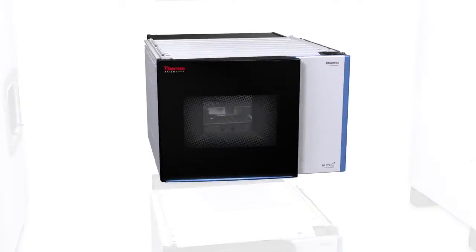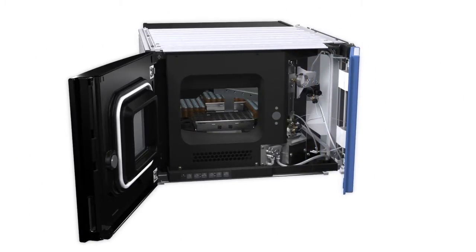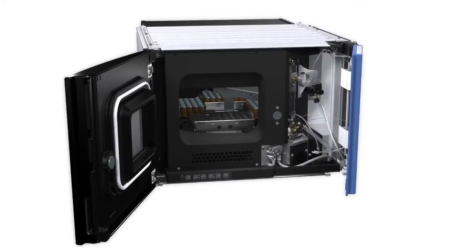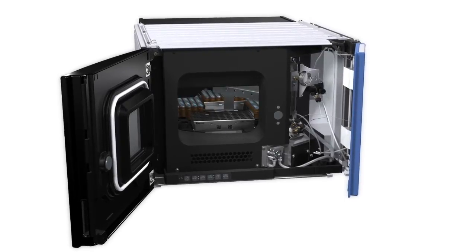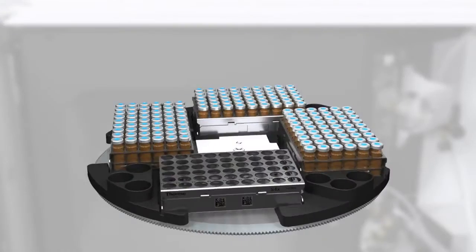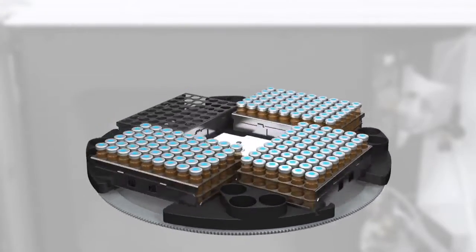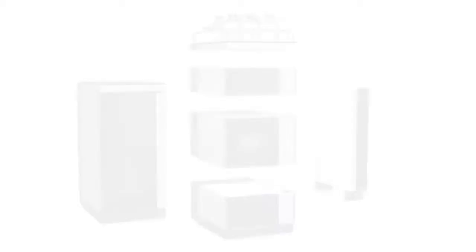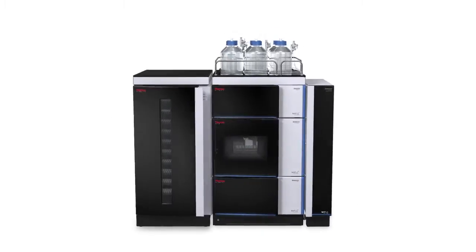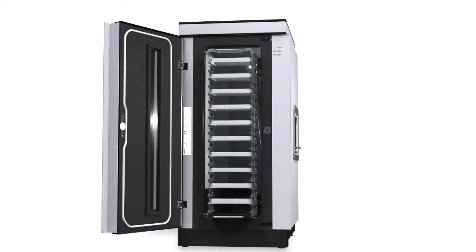The Vanquish UHPLC auto-sampler has unsurpassed sample dosage that will ensure accurate sample injections every time. The auto-sampler has a standard capacity for 4 sample racks and with the Thermo Scientific Vanquish charger plate loading technology added, up to 20 sample racks can be used.